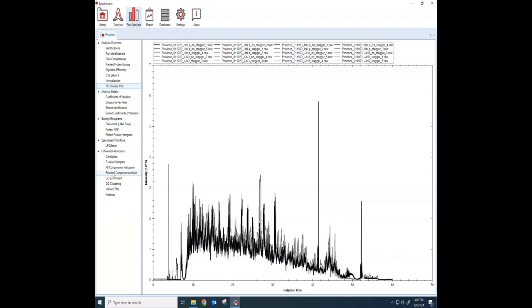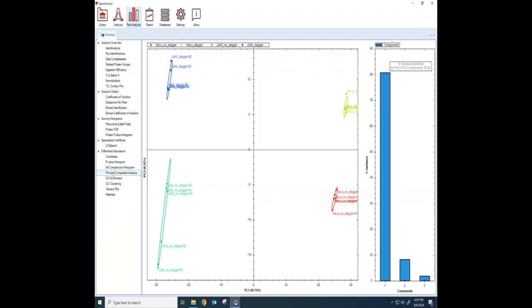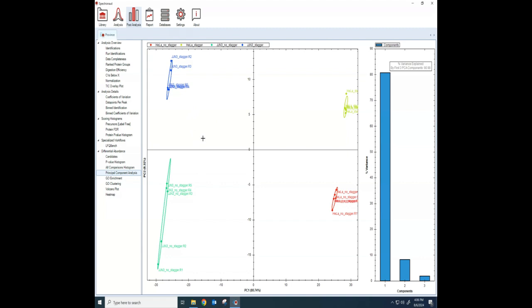If you come down here to principal component analysis, you can see if you have included your groups when you load in your data, which usually we do, it will separate those in a PCA plot. And you can see the difference between the HeLa and the JJN3 and the difference between the staggered and the no staggered for these guys. So all of that's great.